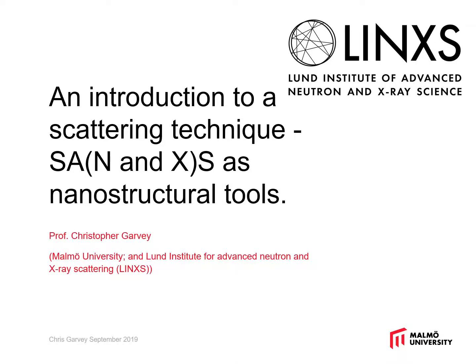So, welcome to the webinar series, which is an introduction to small angle scattering. My name's Chris Garvey, and I'm going to talk about using SANS, that's small angle neutron scattering, and small angle X-ray scattering as tools to understand nanostructure.